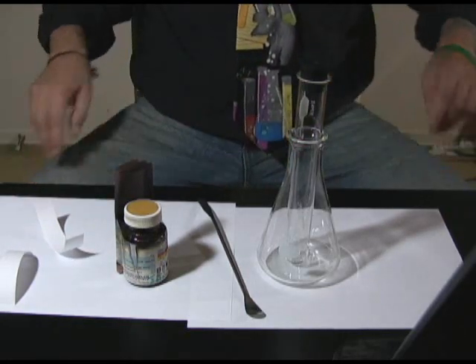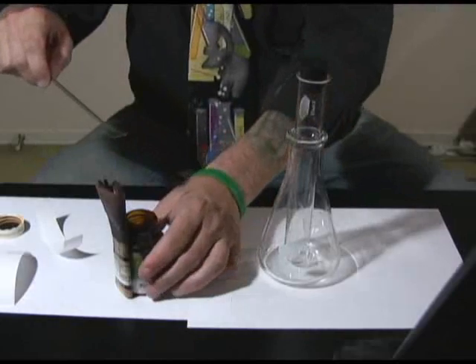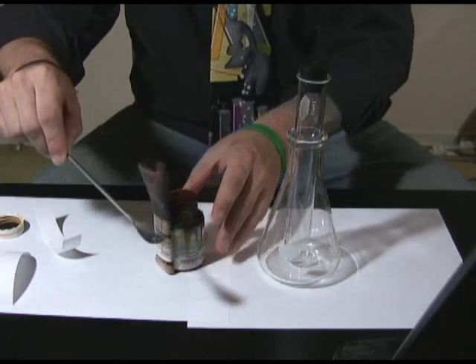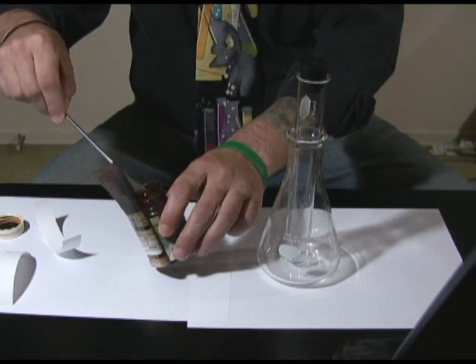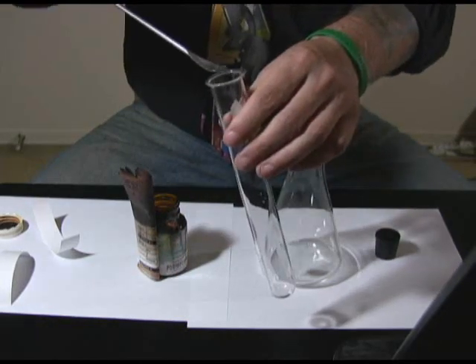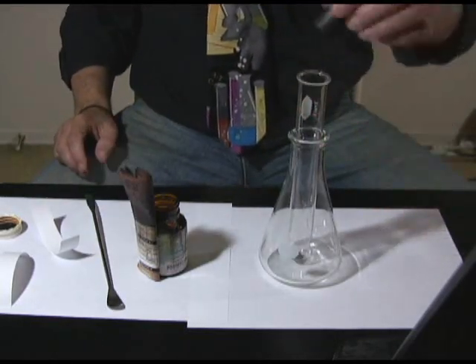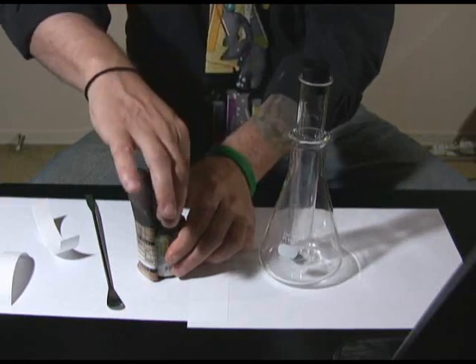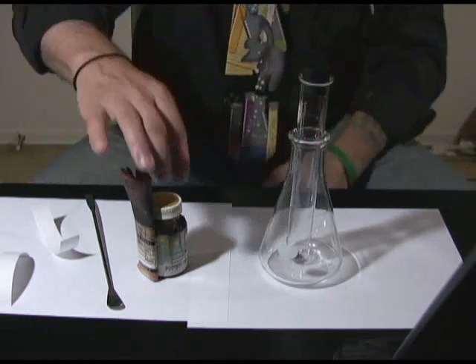I'm going to open up the iodine and add a few crystals to the test tube. I don't need very much. I'm being careful not to inhale it. Now I've got the iodine in the test tube. I'm going to cover it up because iodine only needs very little heat — even just shaking the test tube around creates enough thermal agitation to cause the iodine to sublimate from a solid to a gas.